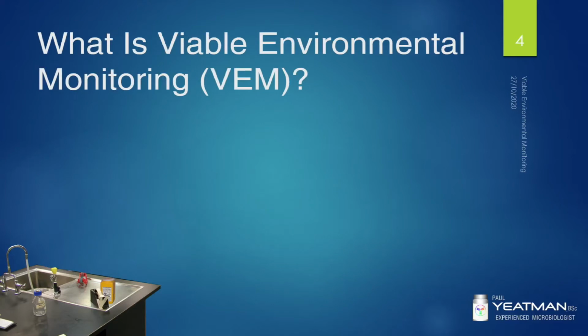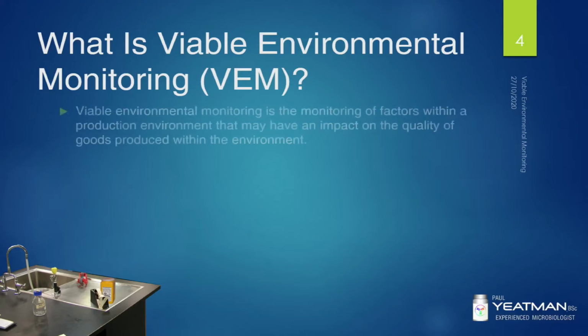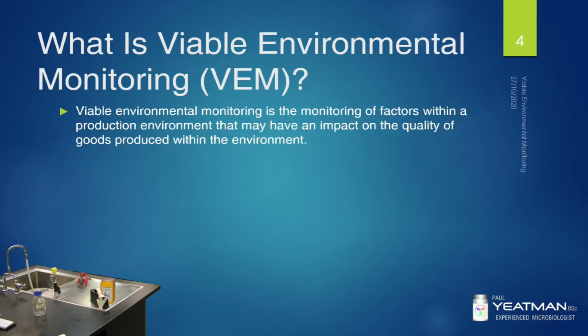Firstly, what is viable environmental monitoring, or VEM? Viable environmental monitoring is the monitoring of factors within a production environment that may have an impact on the quality of goods produced within that environment. So basically, is there an unacceptable level of contamination within that environment, or is contamination in, I guess, the wrong spot or a risky spot? Such factors may be the air, surfaces, product contact surfaces, the filled or pre-filled product, and also production operators. The method of monitoring tends to determine the sampling method.